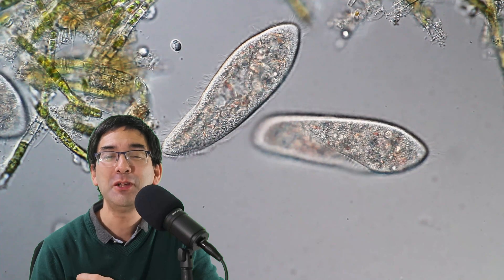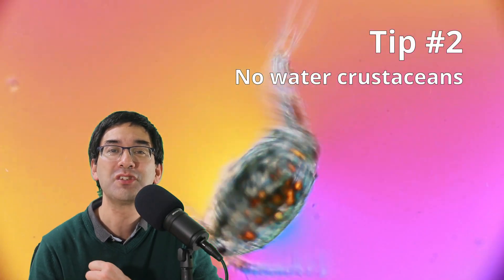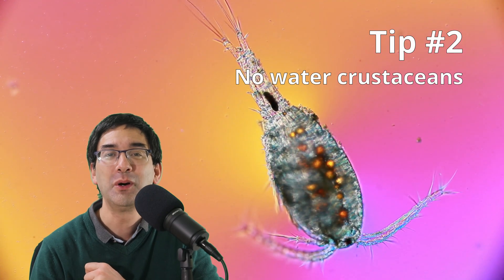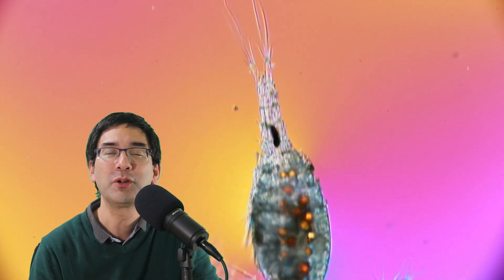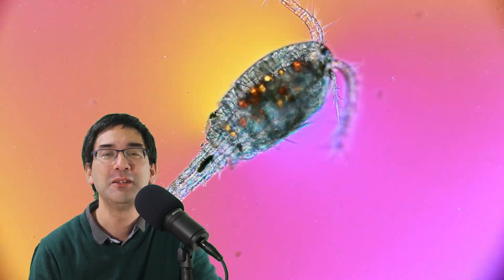Tip number two: make sure that you do not have any water fleas or other water crustaceans in the water sample, because they like to feed on the paramecia. You can spot them quite easily as they're quite large — water fleas are around a millimeter in size — so it's simply something to take into consideration.